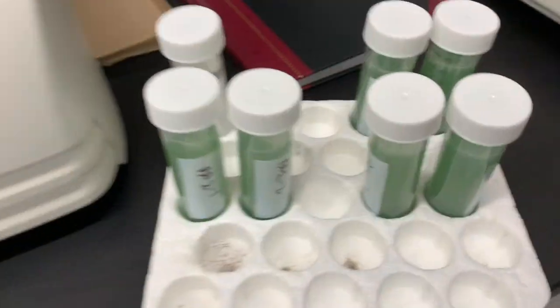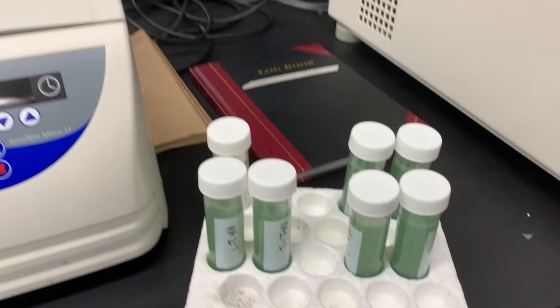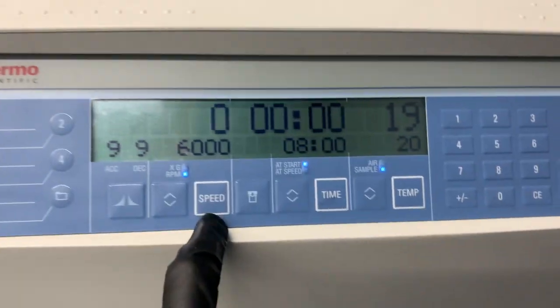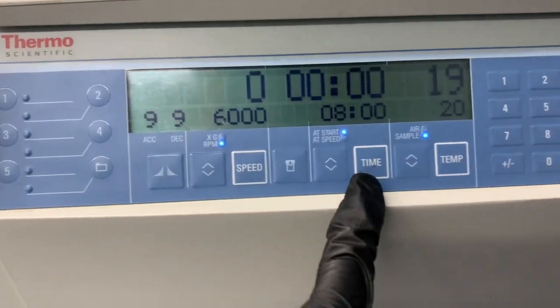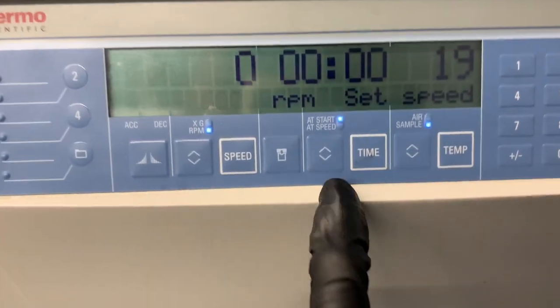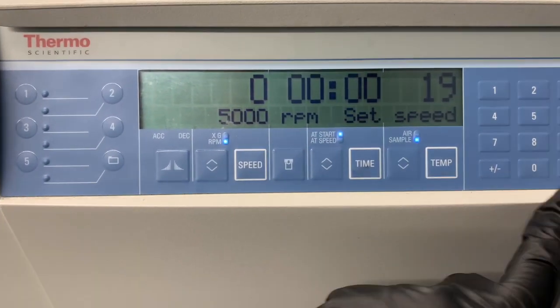At this moment it's really important that you pipette pretty accurately. Now I'm going to take them to the centrifuge. You can turn it on in the back, and make sure you log in the log book that you're using the centrifuge. For the first rounds, I use 5000 RPM for five minutes. You basically just click speed and then change it, and then click time and then change it.